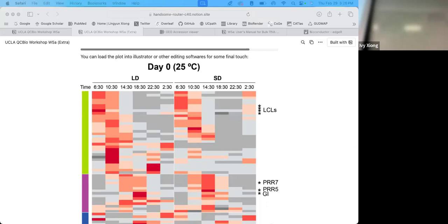Got an MTX. I don't see those pictures. Okay, so now you were downloading. No, I think MTX is the one you just made. So it should be in your history. Yeah, so now it should be in your download folder. File transfer, so go to your download folder. It's fine if I go to environment. Okay, so now here we go. Now just open it.